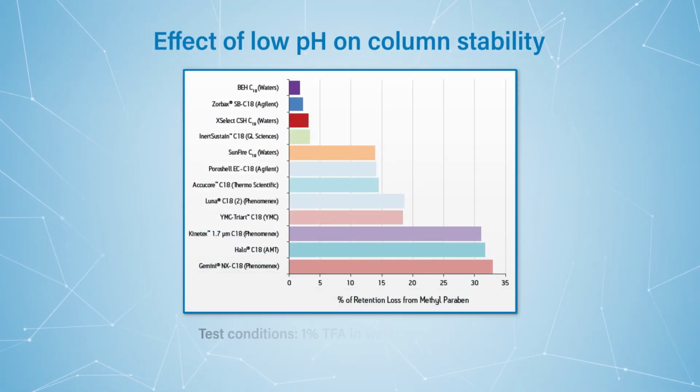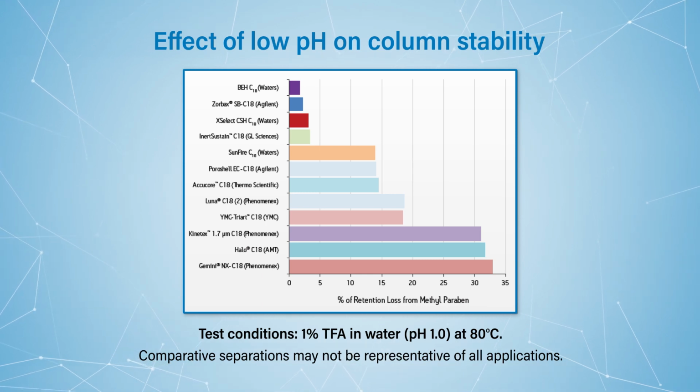Yeah, that's a really great point you make there about low pH, Kenny. When we think about attack of the stationary phase at low pH, it's all about stripping off that bonded phase. So when you mentioned monofunctional versus, say, trifunctional, that one attachment point is much more susceptible to low pH hydrolysis. And here is an example of a bunch of different stationary phases with different bonding properties.